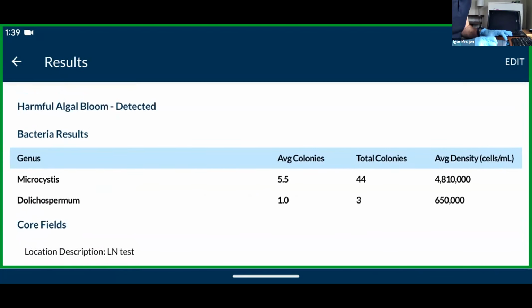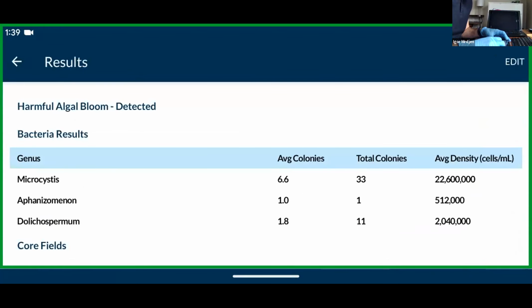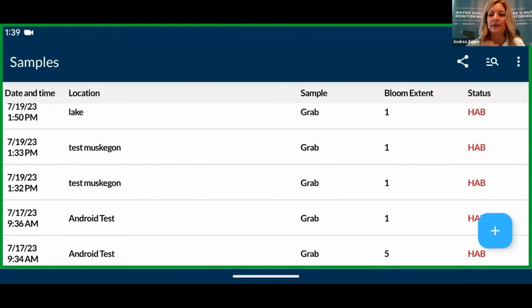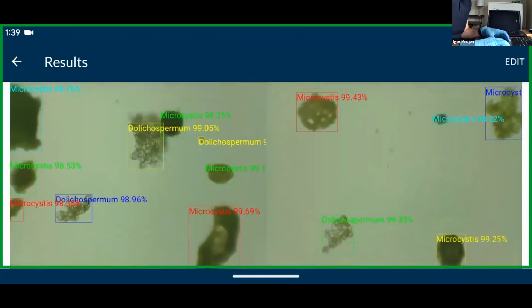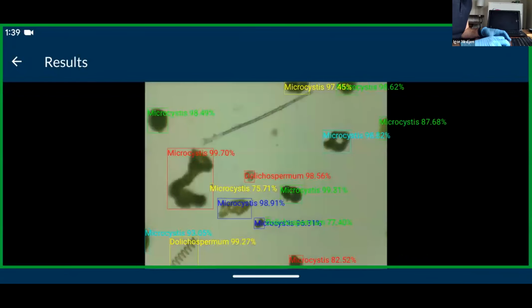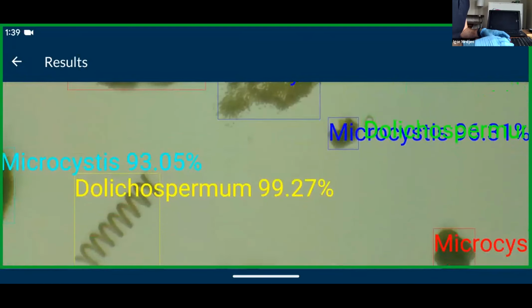Yeah, one other thing I will show you, let's see if I can find the appropriate test. That's not the one. Also, while you're at it, Igor, can you zoom in on those pictures like you can a regular picture, right? So you can get a better idea of. Yes, you can. Here I can show you with, for example, these are some of our more diverse photos here. So when you open up one of these, you can say, oh, I'd like to zoom in. You can actually just zoom in and analyze things a little bit more closely as well.